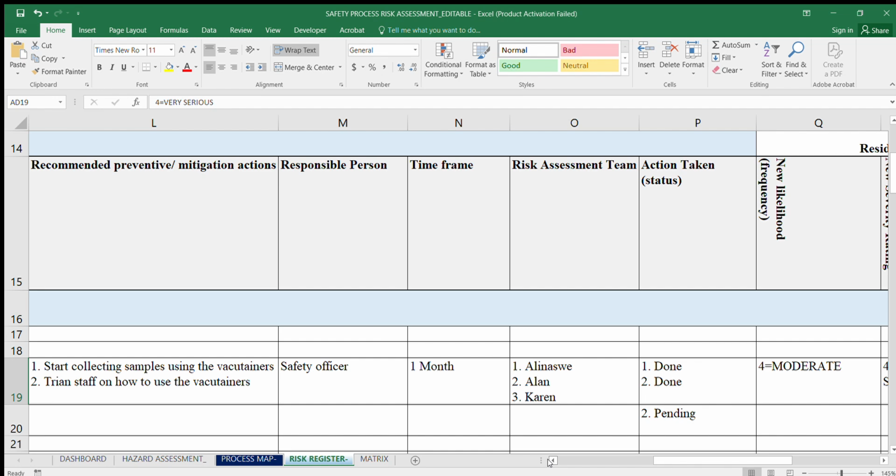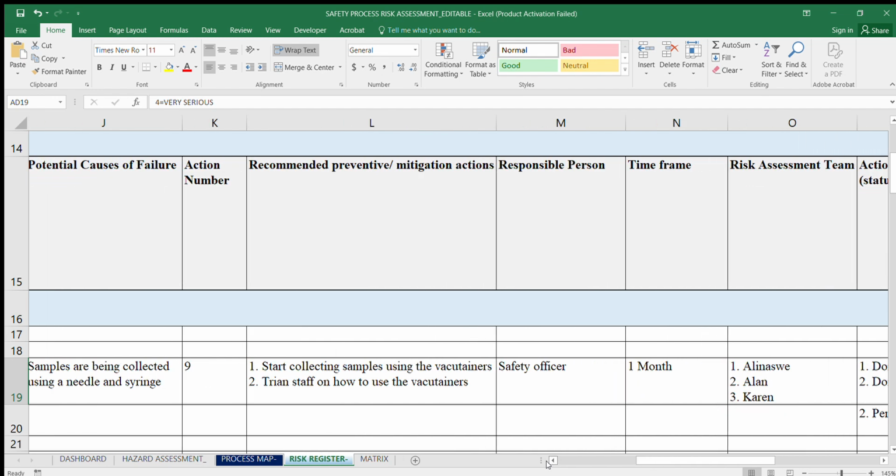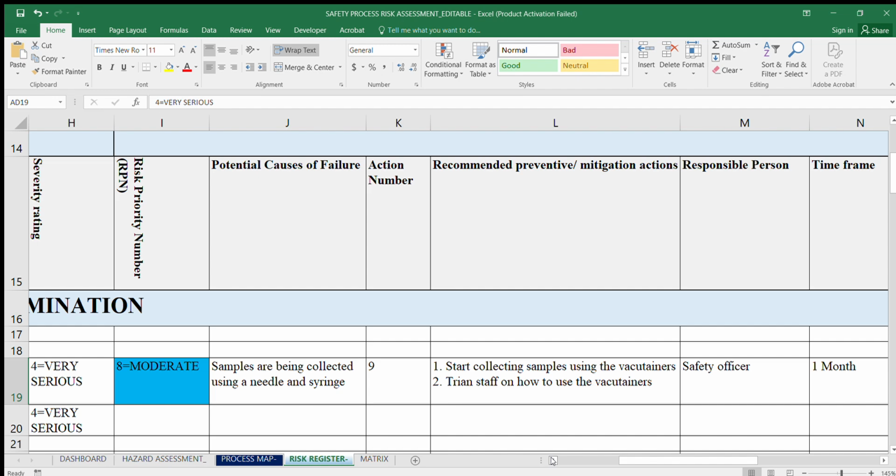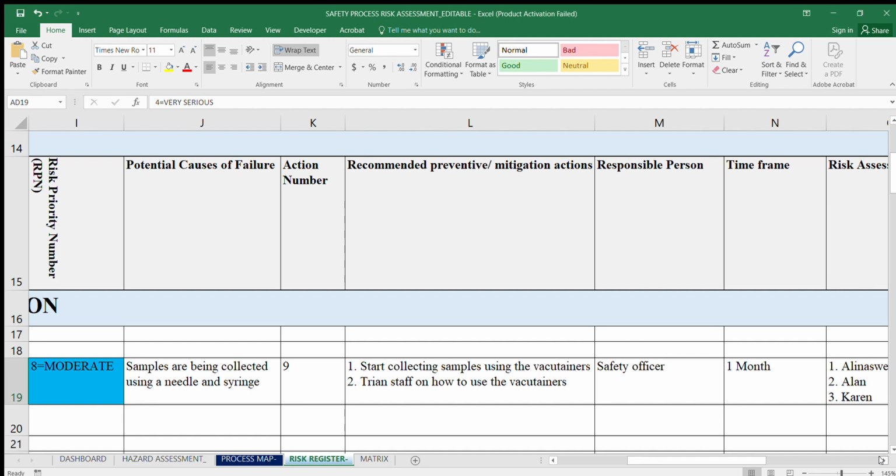Yeah, so I think this example has explained all the parts on how you put up your mitigations, how you calculate your likelihood and consequence, how you actually calculate your risk. Then we've also looked at how you review and what will affect your review, and how the risk falls after review.